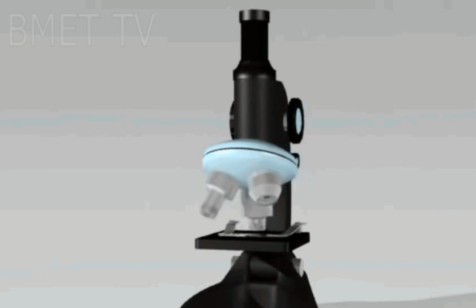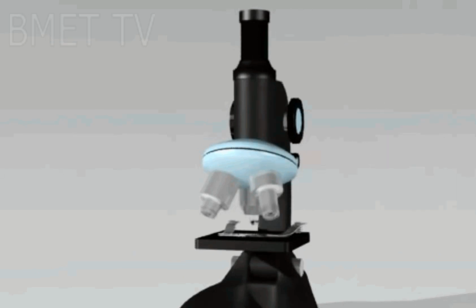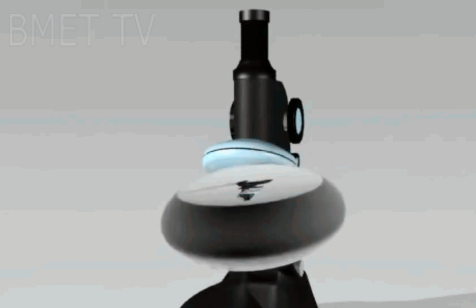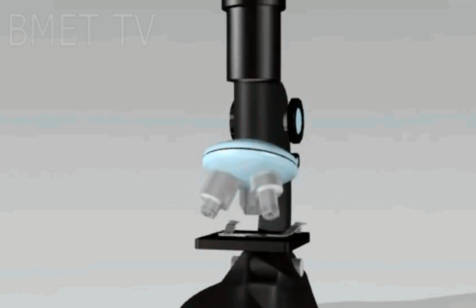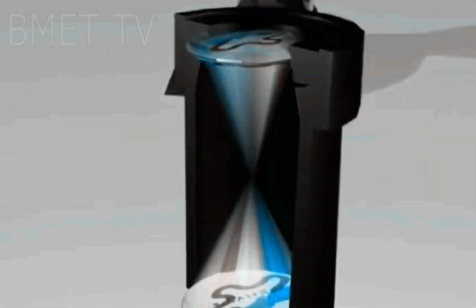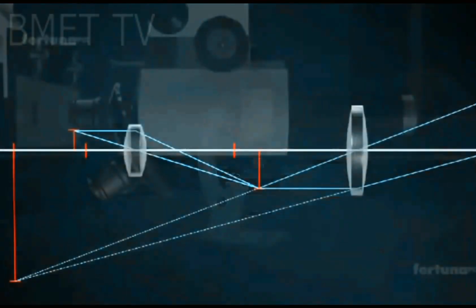Let's look into the principle of the compound microscope. Compound microscopes have a combination of lenses that enhance both magnifying power as well as resolving power. The specimen or object to be examined is usually mounted on a transparent glass slide and positioned on the specimen stage between the condenser lens and objective lens. A beam of visible light from the base is focused by a condenser lens onto the specimen. The objective lens picks up the light transmitted by the specimen and creates a magnified image of the specimen called the primary image inside the body tube. This image is again magnified by the ocular lens or eyepiece.